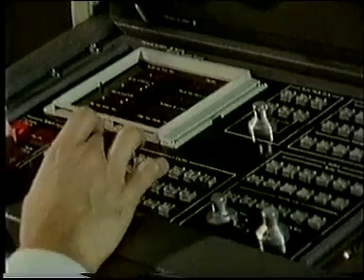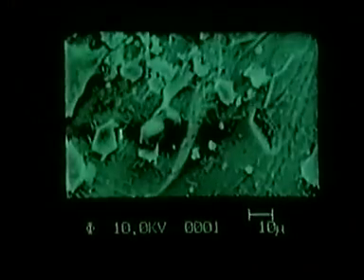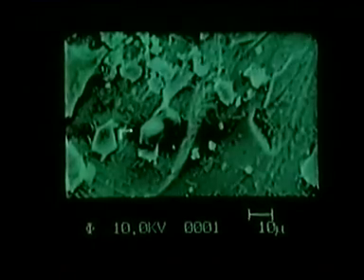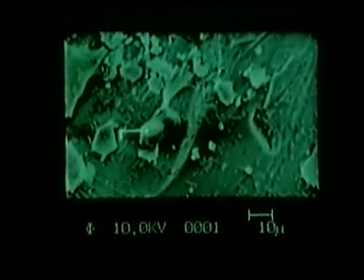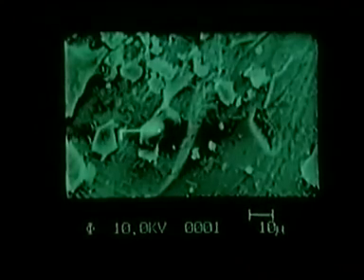It's tiny, only 1/100th of a square millimeter. The spectrometer's electron beam is focused onto a minute part of this area. The dot leaving a track across the center left of the screen is the point probed by the beam. It's about 1/1,000,000th of our chosen area, only 100 millionth of a square millimeter.